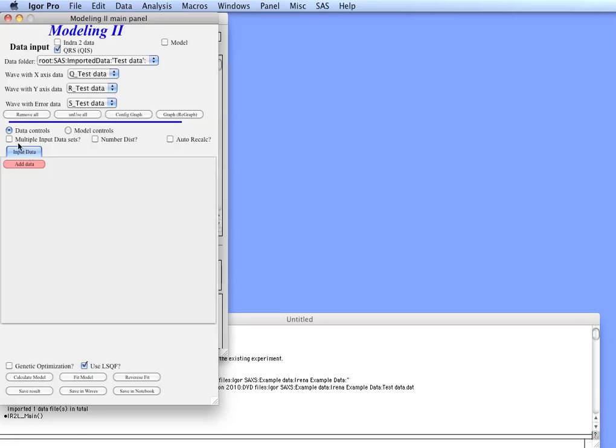We have just one data tab here unless we select multiple input data sets. If we select multiple ones we can put up to ten data sets in there but that gets really complicated and I suggest reading the manual in detail for that.